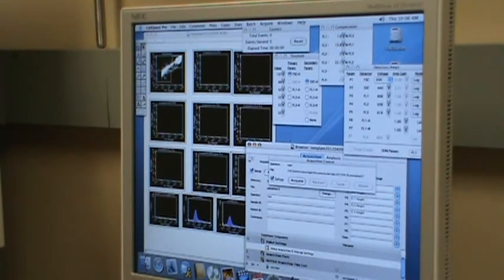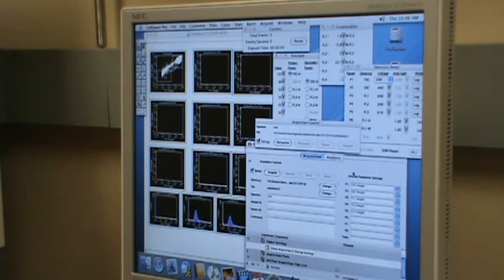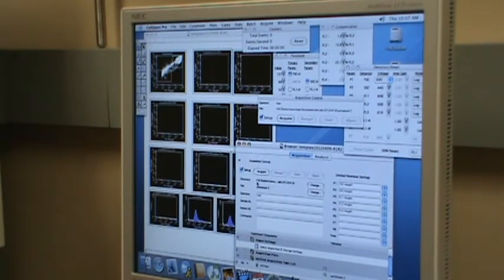Now, see at the acquisition control, there is the checks and setup. If the setup is checked, nothing is recorded. So if you want to record your experimental data, this setup has to be unchecked. If you look at the main acquisition window, there's also a directory and a file. The directory is where you want to save your data, and the file is the file name for the current sample.